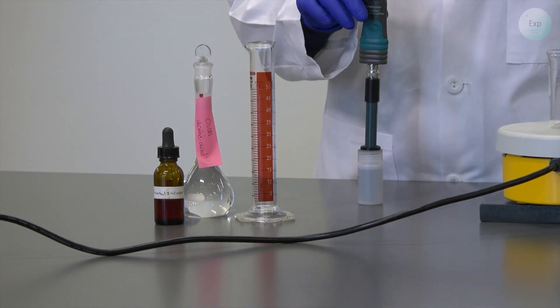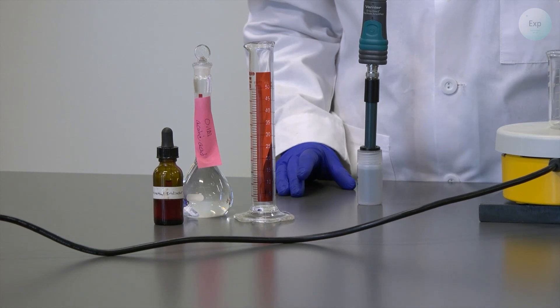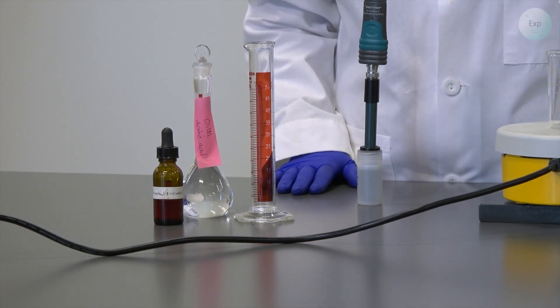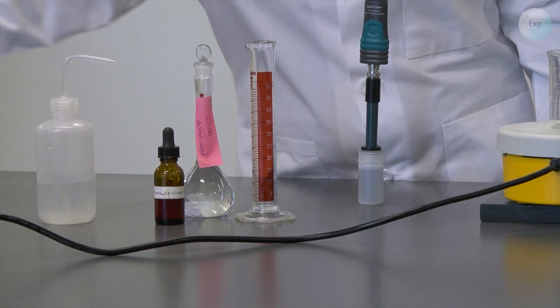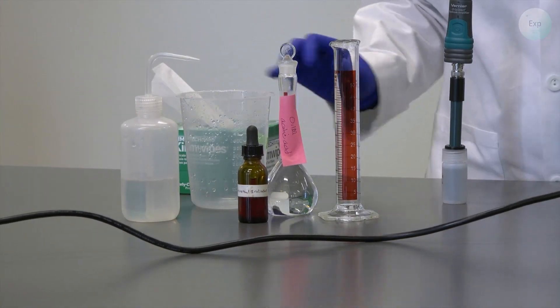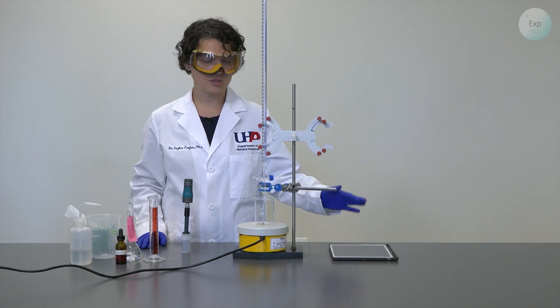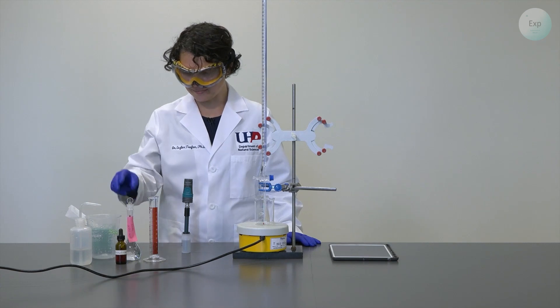Whenever I am transitioning my pH probe between the original buffer solution and the experimental setup, I will rinse it with deionized water and wipe it dry with Kim wipes. For this, I will need my deionized water, a waste container, and the Kim wipes. Throughout the process, we need to make sure that our device connected to the pH probe does not shut down.